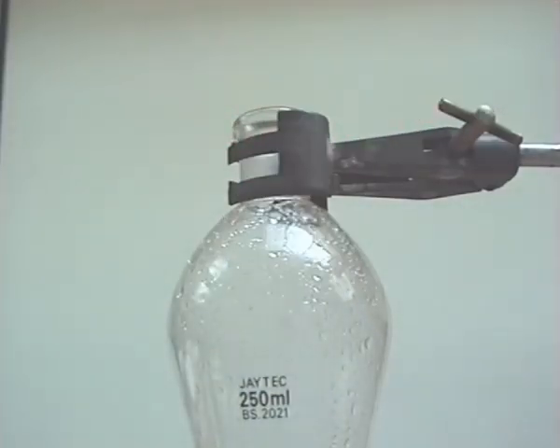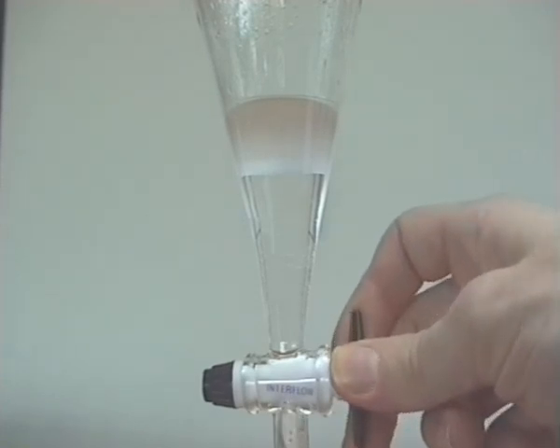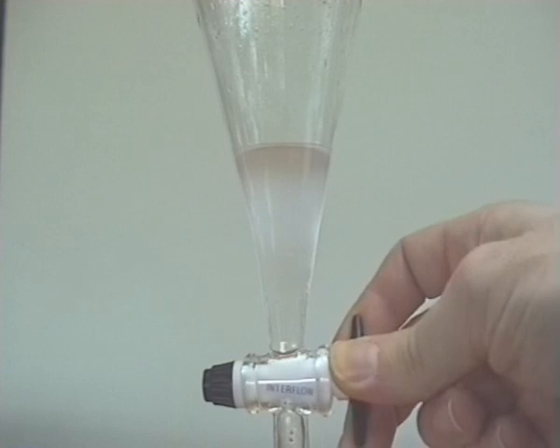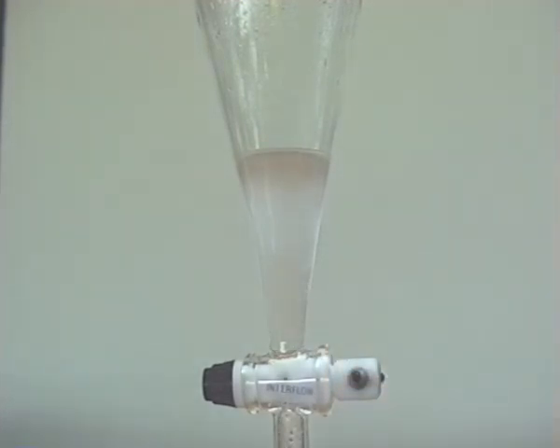The stopper was removed and the lower aqueous layer was again run off and discarded. Further reaction with sodium hydrogen carbonate solution was carried out until no further effervescence was seen.